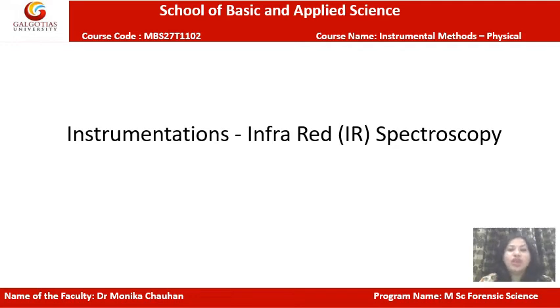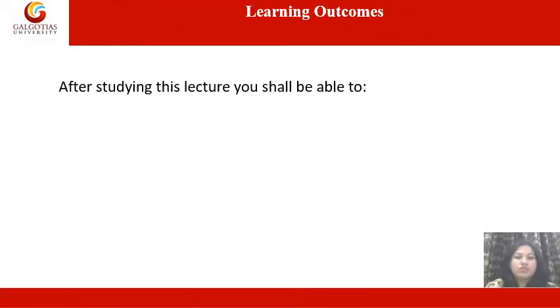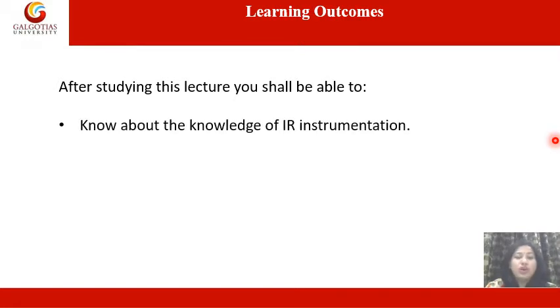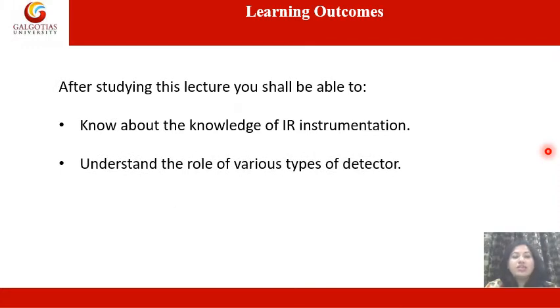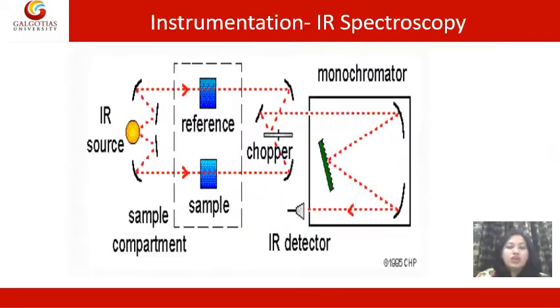Everyone, today I am here to discuss the instrumentation of IR spectroscopy. After studying this lecture, you shall be able to know about IR instrumentation, understand the role of various types of detector, and know about the FTIR instrument of IR spectroscopy. Now we will discuss the instrumentation of IR.